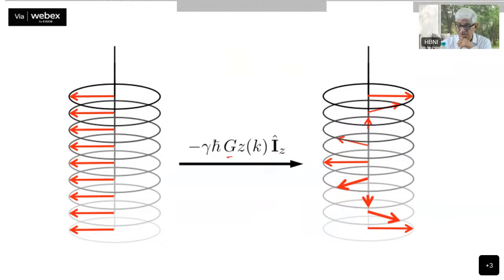And then the different portions of the signal here: the ones which are here have moved there, the next one has moved to this point, the third one has moved to this point, the fourth one has moved here. See, they're all dephased out. In the transverse plane, they have all gone to different positions. The same thing was indicated in the previous slide in only one small segment, but here it can spread over the entire plane. So that depends upon the strength of your gradient field.